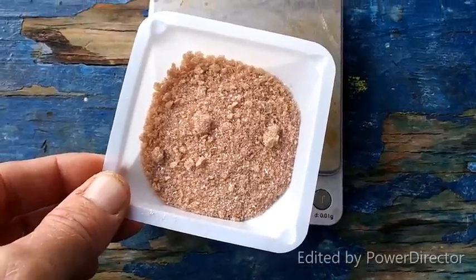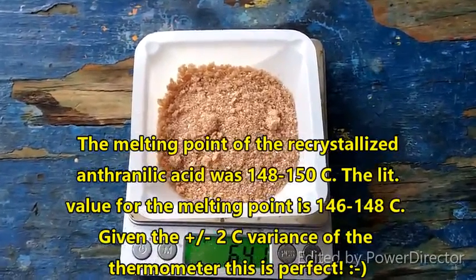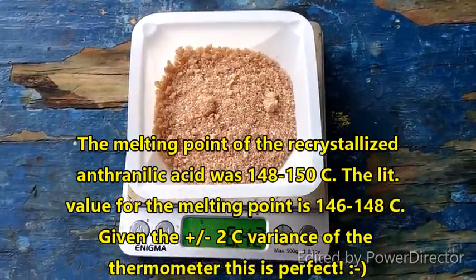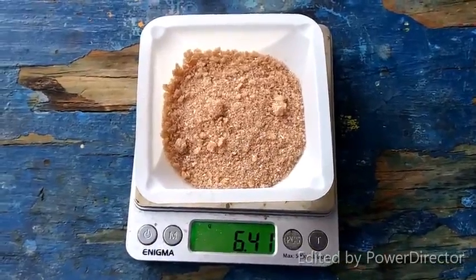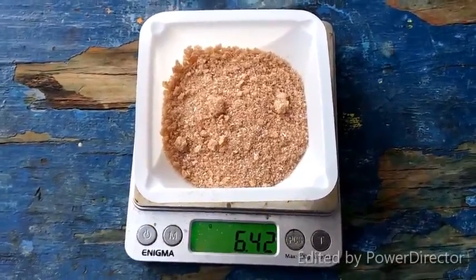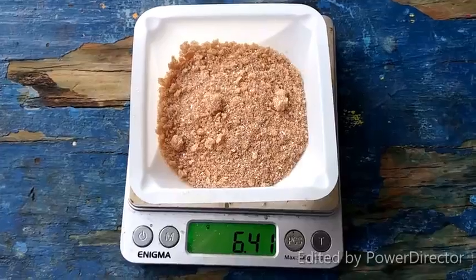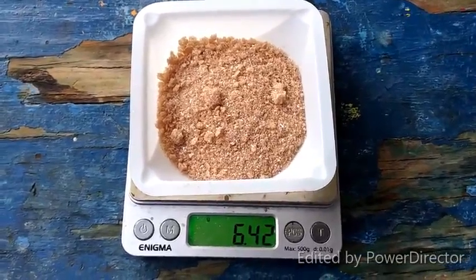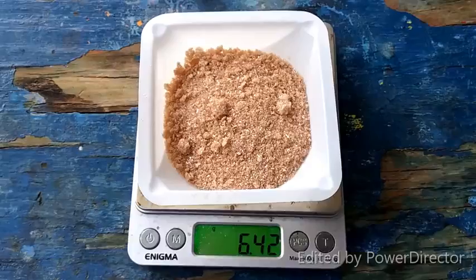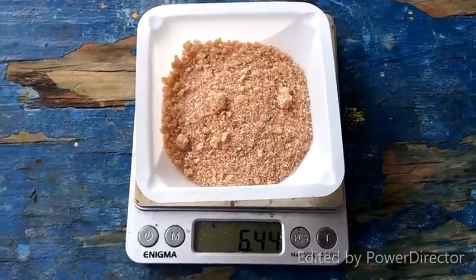So, yeah, there you have it, people. The synthesis of anthranilic acid from phthalimide. Again, got a very crappy yield, but I think that was probably just from the hardware store HCl that I used. I would imagine that if you had used reagent grade HCl and sodium hypochlorite, you'd get a much better yield than this. And if you had recovered the anthranilic acid from the copper anthranilate, obviously your yield would be much better then too. But I am happy with this.